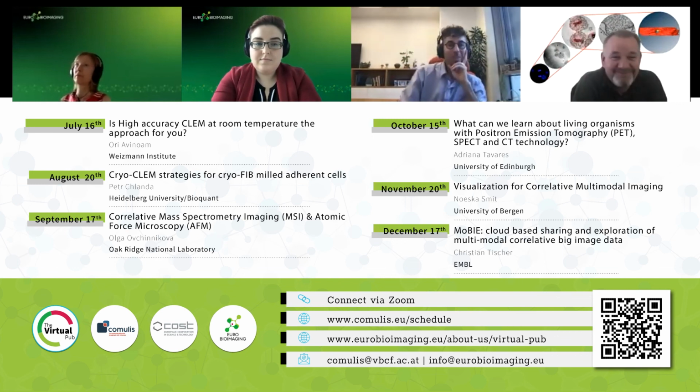Thanks. You also ask how long it takes, but that's a tricky question. On the fly at the microscope, I know that it's not so easy. You can do the alignment, but if you have a lot of positions, it takes time to align each of the images, and the microscope time is costly.